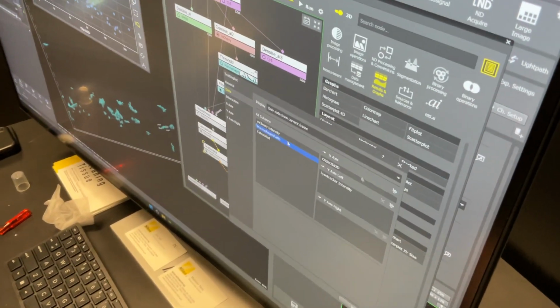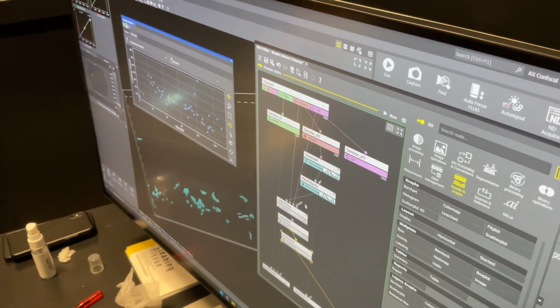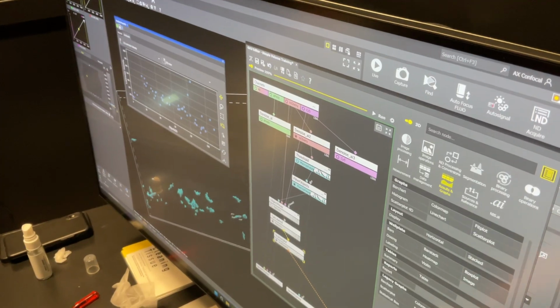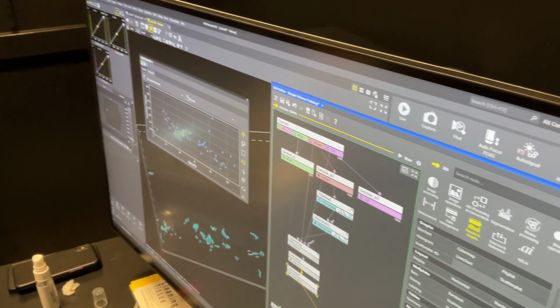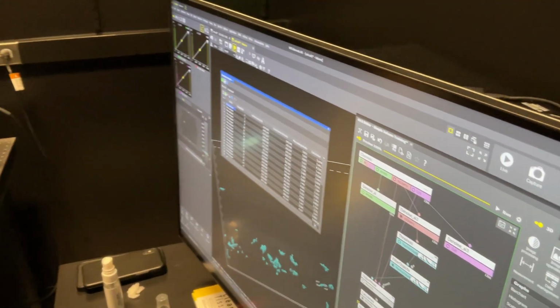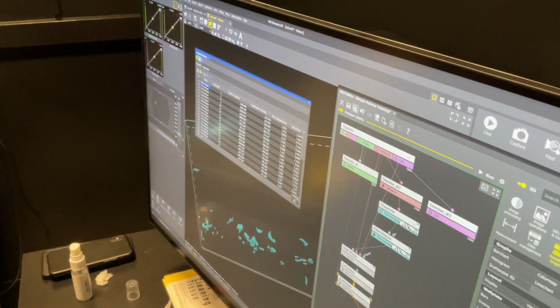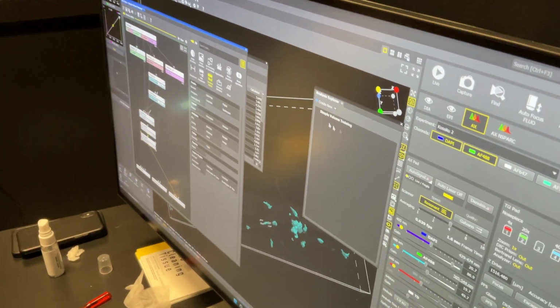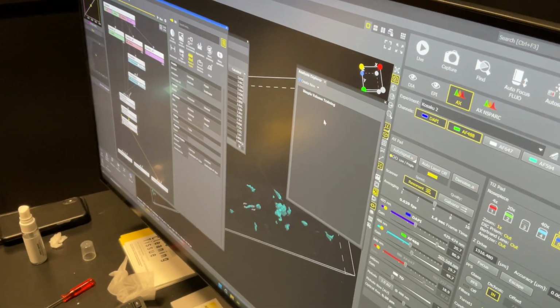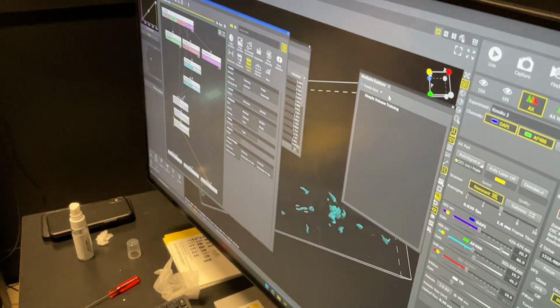So we have a bunch of stuff. And the output from this: once you're happy with those records, you can always kick it out to Excel. When you run this in the GA3, it will show you each iteration, and if you select it, there will be a little table. You click that, and this will pop the data for that image back up.